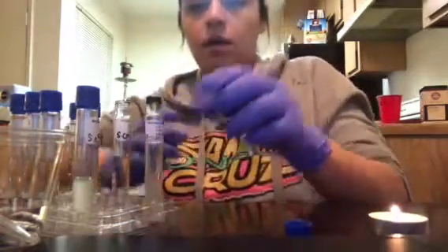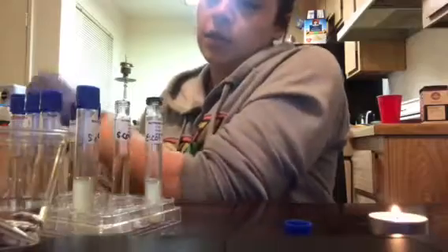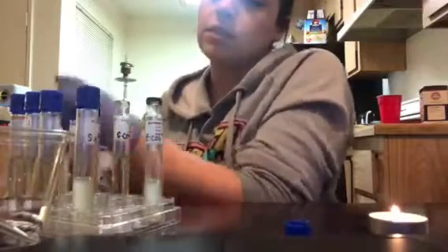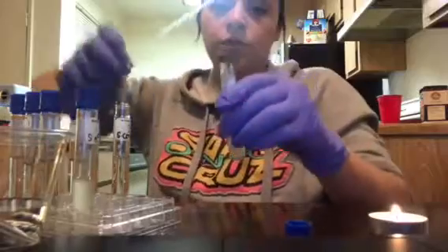Okay. And then I'm going to take my dropper and I'm going to shake that out to dry. I think I should have done this first. I think this is the first step, but it'll be good. Okay. So now that I've flamed and sterilized the tips, I'm going to get 2 drops from the active culture.